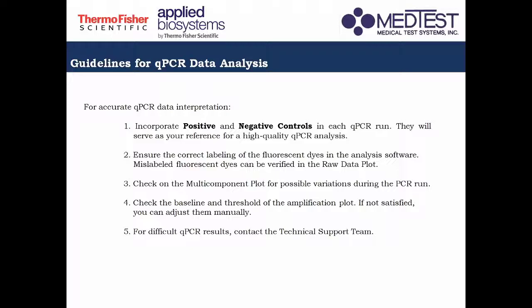If you have a detection happening in your negative control, ibig sabihin may nade-detect siyang viral DNA doon sa samples nyo. Ibig sabihin there is possibility of contamination in your samples. So importante tong controls. It should always be incorporated in each of your qPCR run.